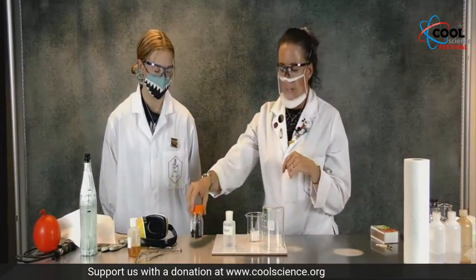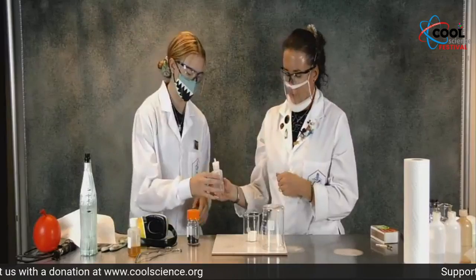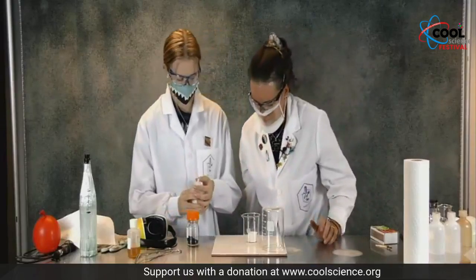We're going to use something called hypergolic. That's a German word for quick igniting. So two substances are going to touch and they're going to ignite. And we're going to produce hot gases really quickly, which is really important for rocketry. Kelly, if you would put 5 drops on there for me, please. Or a little more, it's okay.